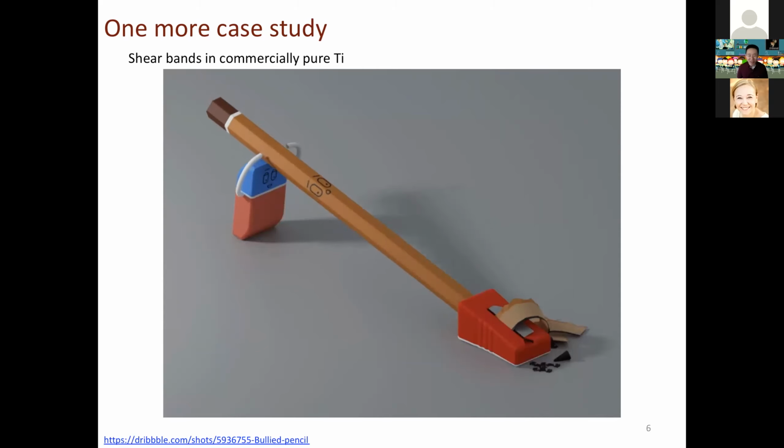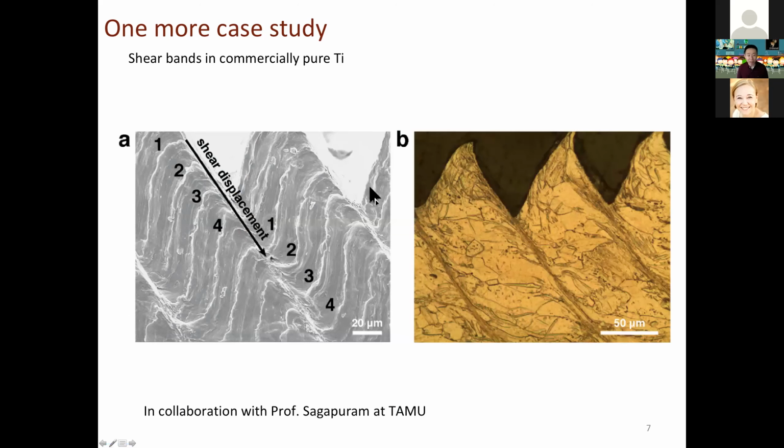They don't really use a real pen to do writing anymore. The pencil will get dull after using for a while, and you need to sharpen the pencil. You put it in the sharpener, and a strip, like a chip, will come out. Now, imagine you replace that pencil with a metal rod and do the same thing, do the cutting, and a strip can also come out as well. That's exactly what you see here.